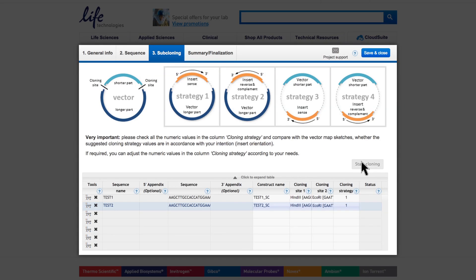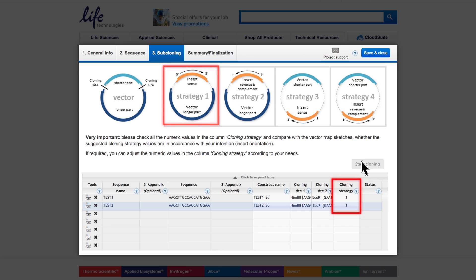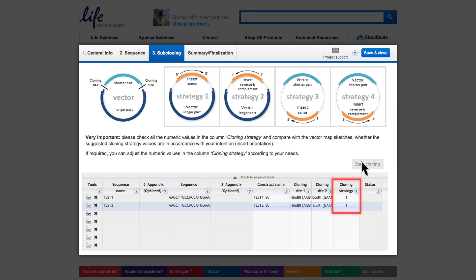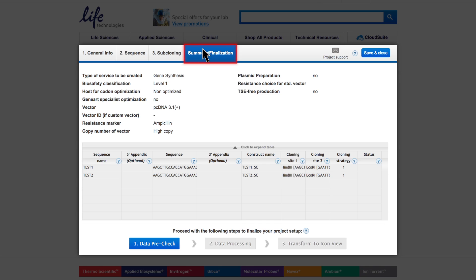Output will be a number indicating the identified cloning strategy. Check whether the selected strategy is in accordance with your intention. If not, click on the Cloning Strategy field to select the available alternative options. When you are done with all of your inputs, move to the Summary and Finalization tab.